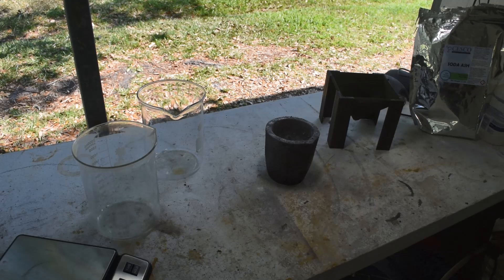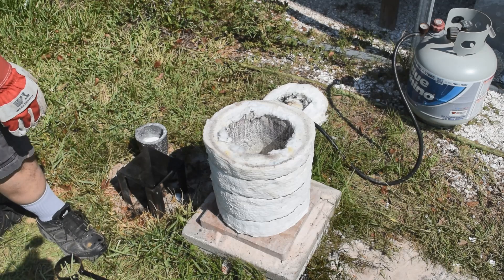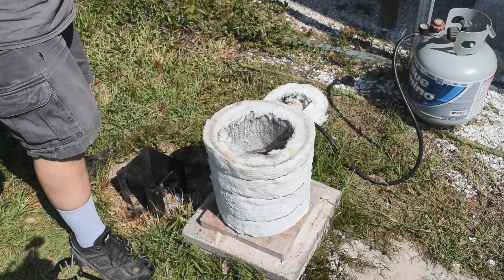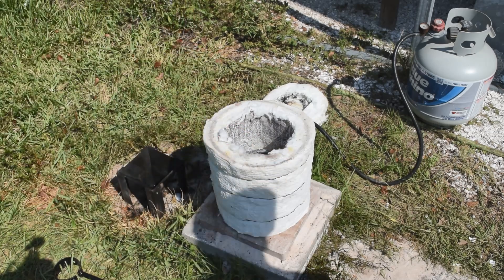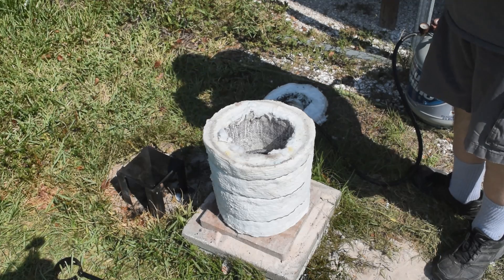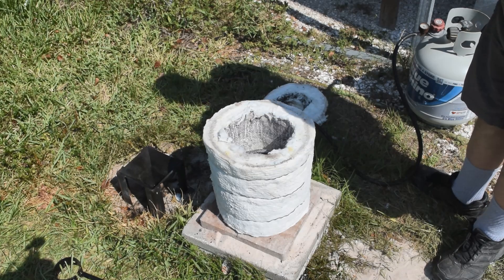Got to get this done before it gets up to 100 degrees today — it'll be too hot to run the furnace then. There's the brand new foundry furnace. It probably took me less than an hour to build. It took about a day to dry out after I saturated the fiber with sodium silicate solution to rigidize it. I broke it in by melting down some of my cement copper, and it worked great — got up to the temperature of copper melting, which we shouldn't have to get anywhere near that high today. So this should work great. Let me get it lit.